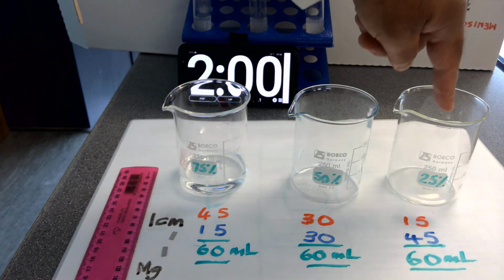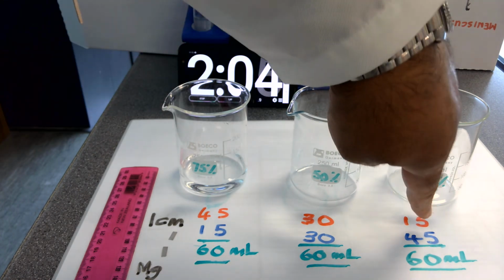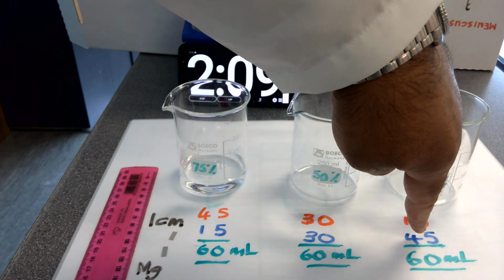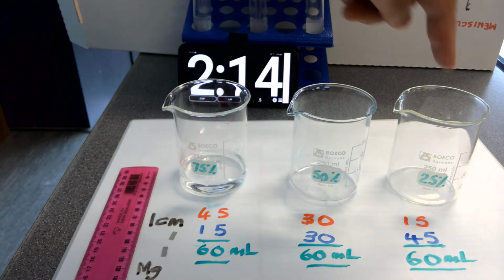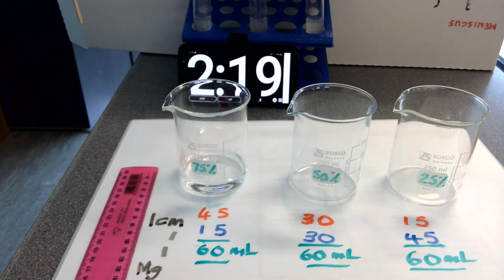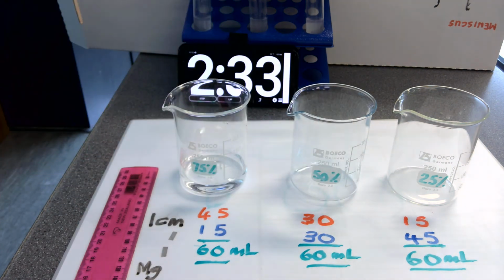We would then repeat that process for a 25% concentration of acid with 15 millilitres of acid added to 45 millilitres of water for a total of 60 millilitres, and then put 10 millilitres of 25% acid into 3 new separate boiling tubes and add our magnesium ribbon again. A little technical error I made there, which I want to correct in case those people who are paying attention are paying attention. You add acid to water.